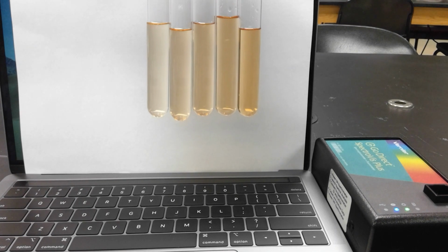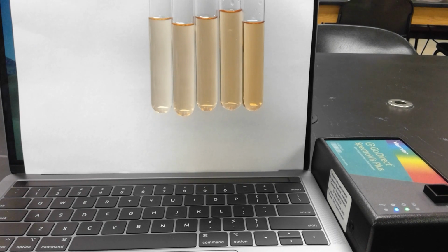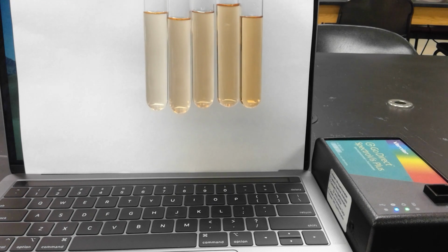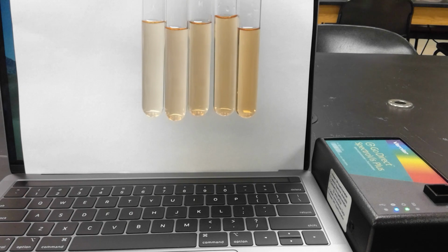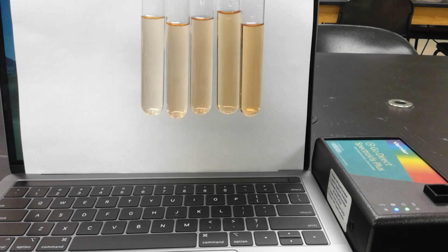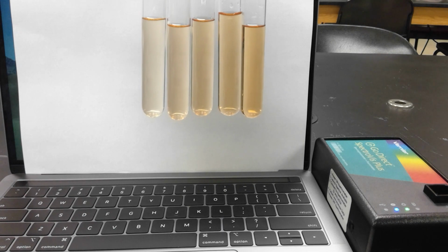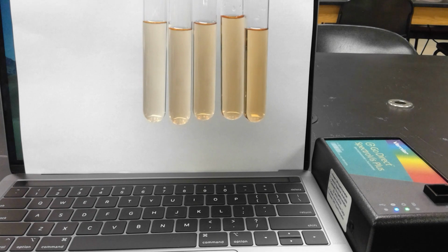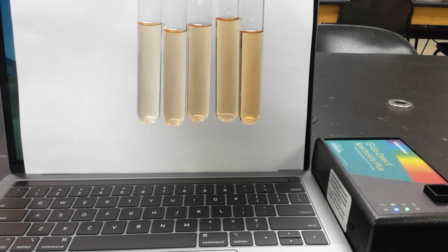Here are the standard solutions that we made in the previous video. If you see them, they range from a very faint color to a much darker color, and we can quantify this using a UV-vis spectrometer and create something called a Beer's Law plot. This Beer's Law plot will allow us to determine the amount of the product in the unknown solutions that we will make and measure next.